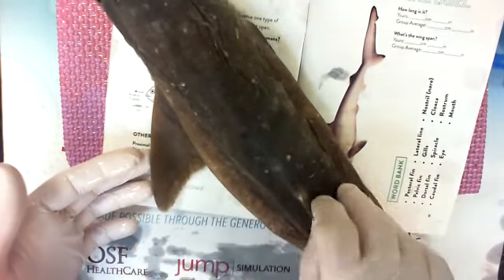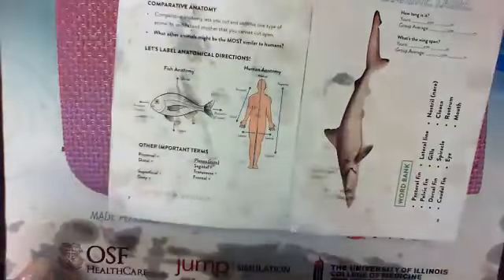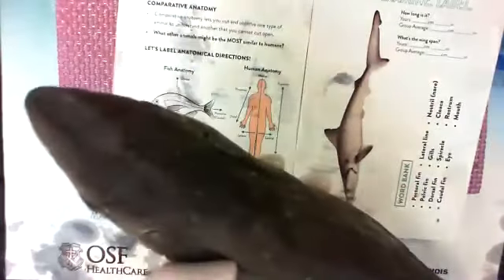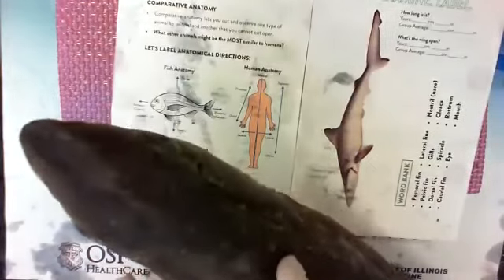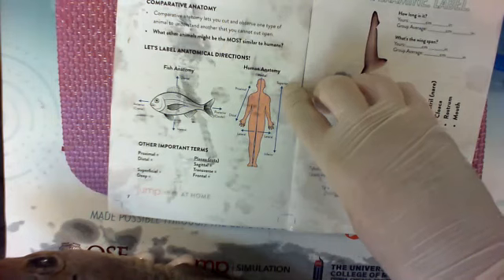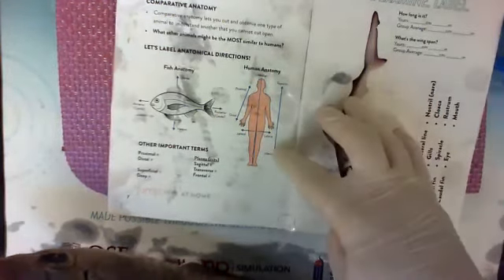So I would say the dorsal fin is medial to the pectoral fin, or vice versa. Flip it around. If I'm saying something's above, and I really mean up and down, I would say, well, on a fish it's slightly different, but on a human, like this. It's superior, it means above. Like your boss is your superior. You're their inferior. So inferior is below.